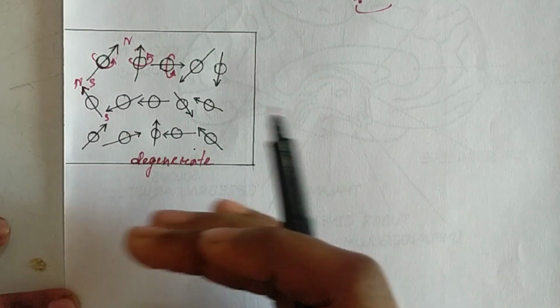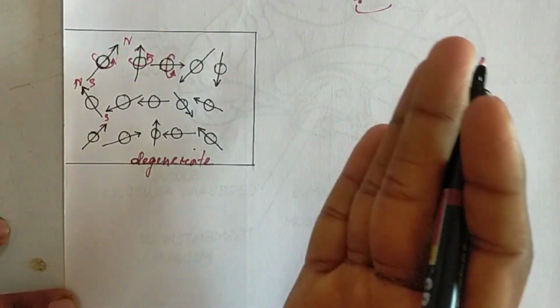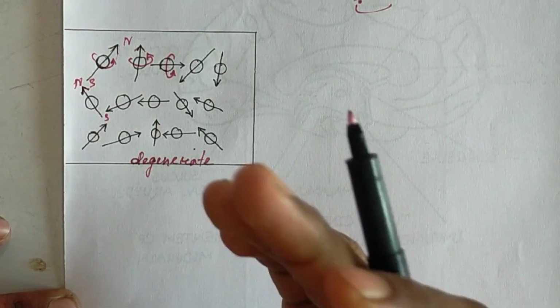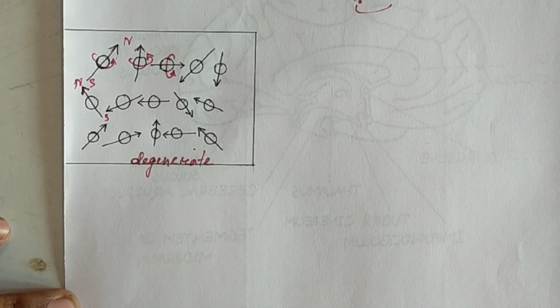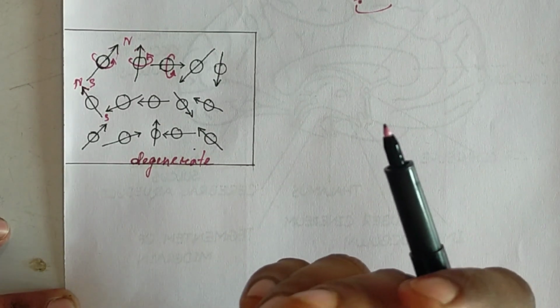These nuclei are oriented in different directions randomly, because there is no presence of an external magnetic field. So this state of the nucleus is called the degenerate state.